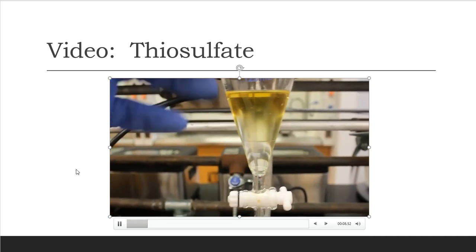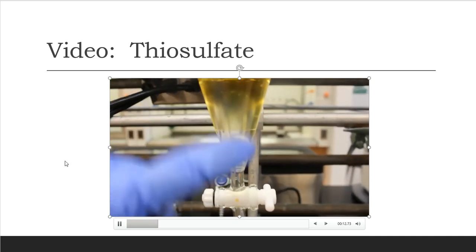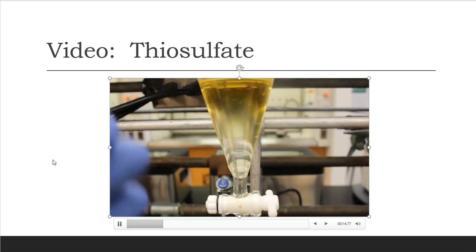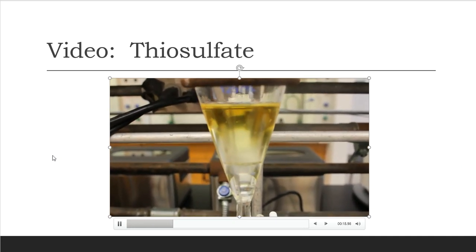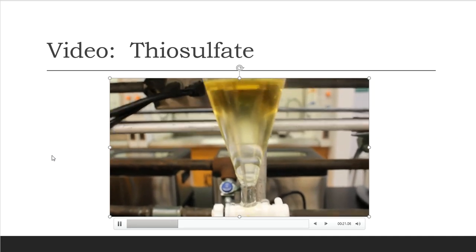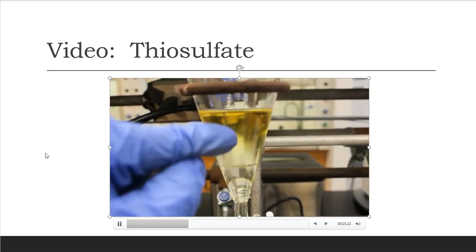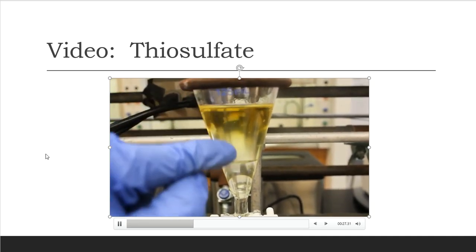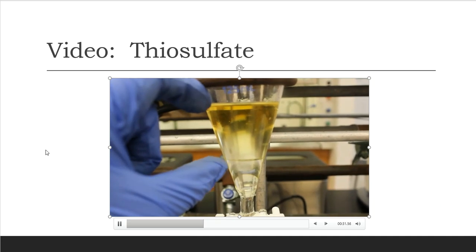So I put it into the separatory funnel, I gave it a good mix, I gave it a good shake, and you're still seeing 2 layers. And this is normal because sodium thiosulfate was made in water, and I still have my organic layer in here as well. The division line is actually right here. It looks like the top still has a little bit of yellowish tinge, and the procedure said that that still might be present, so I'm okay with that.